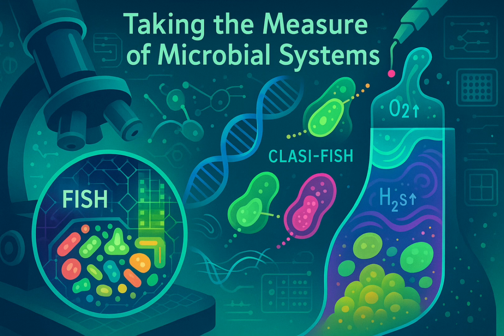Pretty much. You can take a slice of soil or a biofilm, treat it with differently colored FISH probes, and literally see which bacteria are next to which archaea or where your specific target species is living, and roughly how many there are compared to the total DAPI-stained cells. Identity, location, abundance, all visualized.